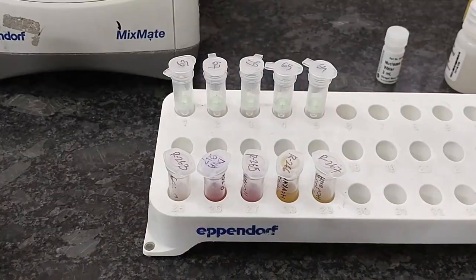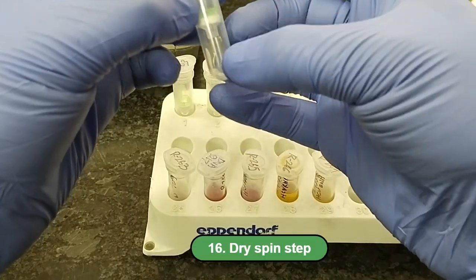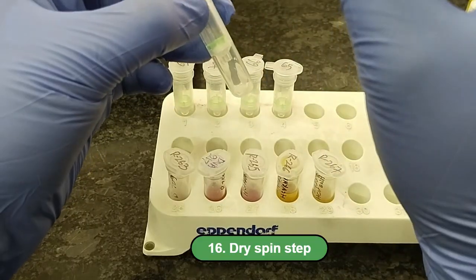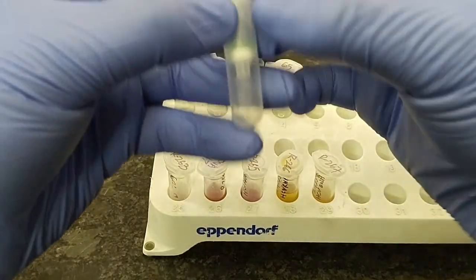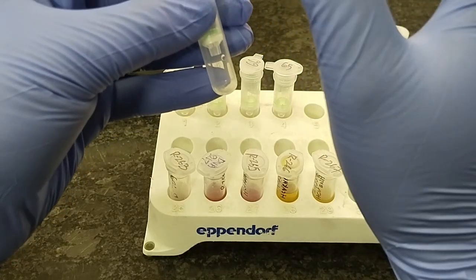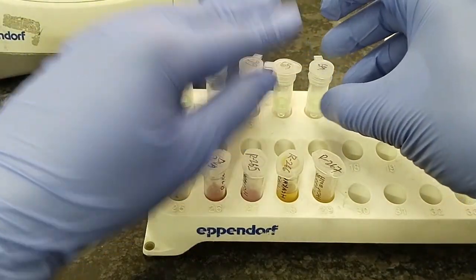The purpose of dry spin is that you can see there are a few droplets left over here, so we need to dry the column as far as possible by centrifuging at 12,000 rpm for 1 or 2 minutes, without adding any type of reagent. So let's do the dry spin.